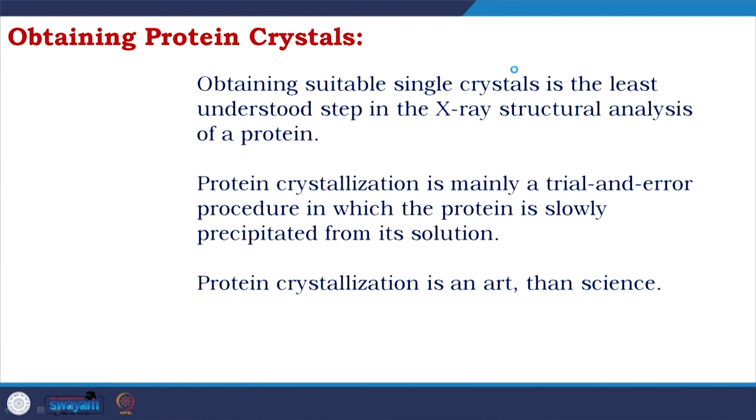You just do your work best, you do the target selection, you do the optimization, you do the host choice, you do the cloning, you do the transformation, you do the overexpression, you do the purification, get the protein, set up the crystal, then you go home, every day come and check and just hope that one sunny day you will find a crystal. That is the part we crystallographers hate about crystallography. And people say crystallization is an art, crystallography is a science, crystallization is an art.